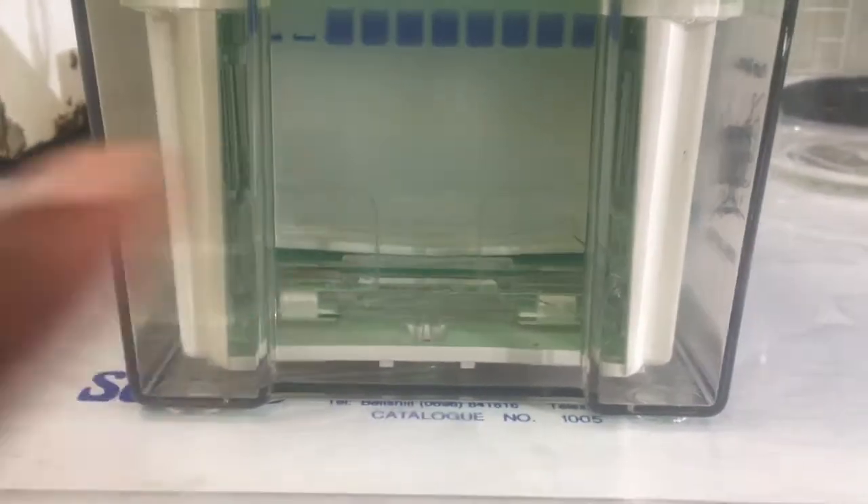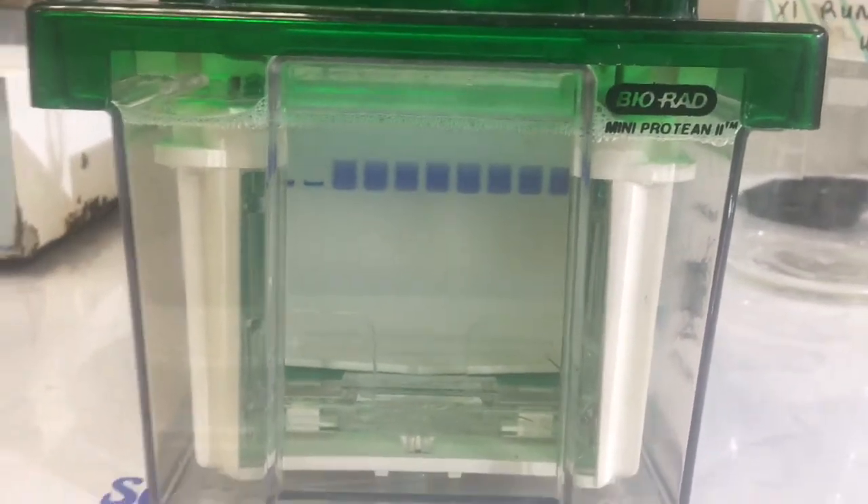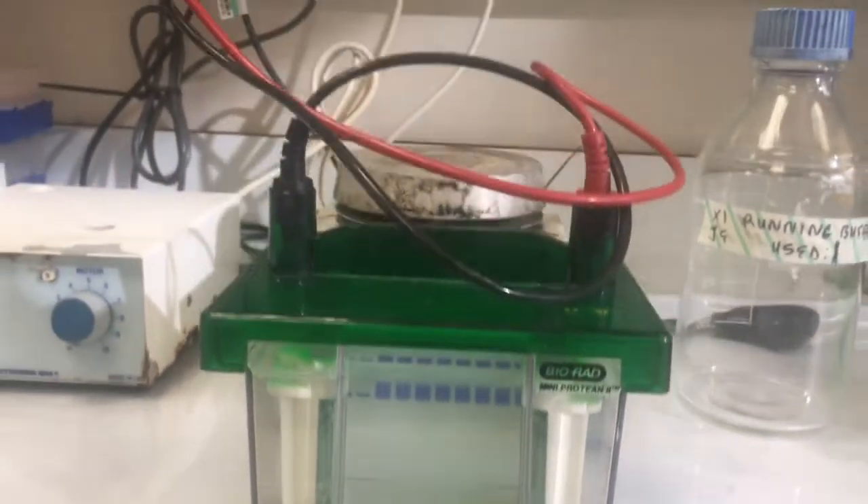I don't know if you can see, but there are bubbles rising right there — that means it's working. So I'm just going to leave that, have some lunch, and come back to check on it.